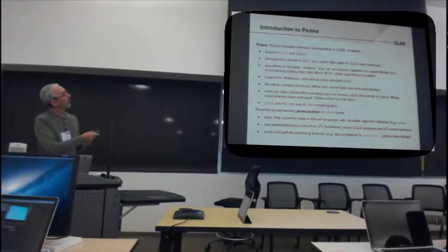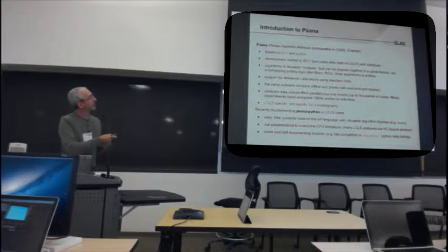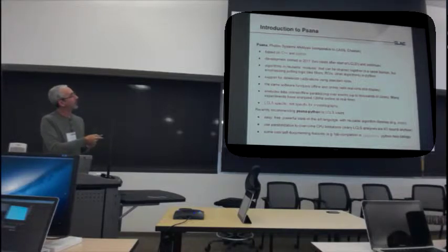One of the weird things about Psana, I should probably speed up here a little bit, is that when LCLS turned on, I was doing the data acquisition systems at that point, and there was no supported offline LCLS analysis software the day that LCLS turned on. When people were coming up to me because I knew about the data from data acquisition, they said, how do I import my terabytes of data into Excel?